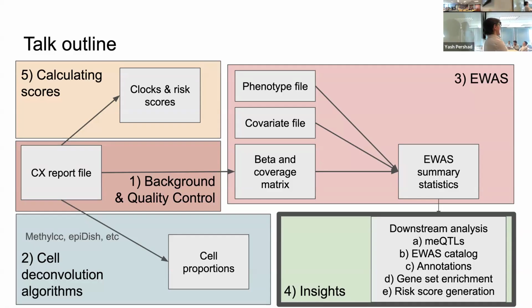Either way is probably pretty comparable. That's a good point. So either way is good, but you don't want to introduce missingness for no reason, which I've done. So don't do what I did.